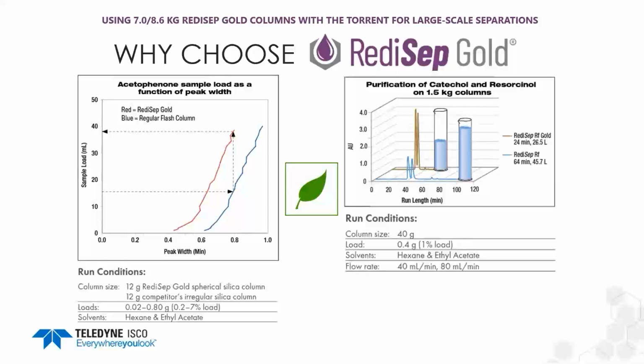Or on the right here, you could run this same separation, same loading at a faster flow rate and over a shorter gradient period, and you'd be able to have some significant solvent savings. And so in this run on a 40-gram column, you can run it over a steeper gradient because of the separation advantage there, and you could have a shorter separation by about 40 minutes here and save about 20 liters of solvent. And so that's an advantage both in time and cost and in sustainability.